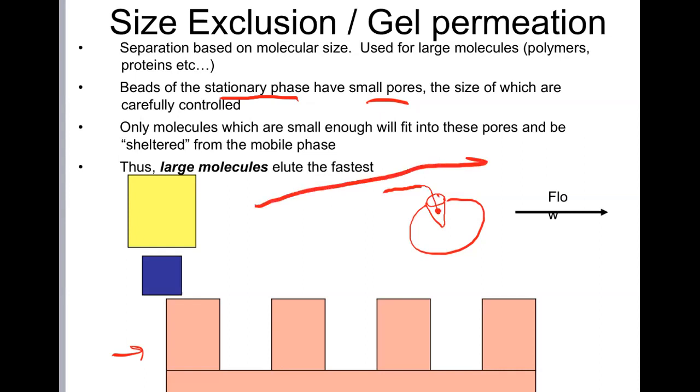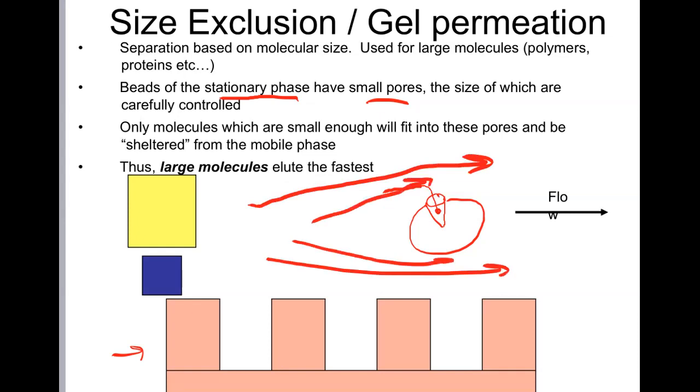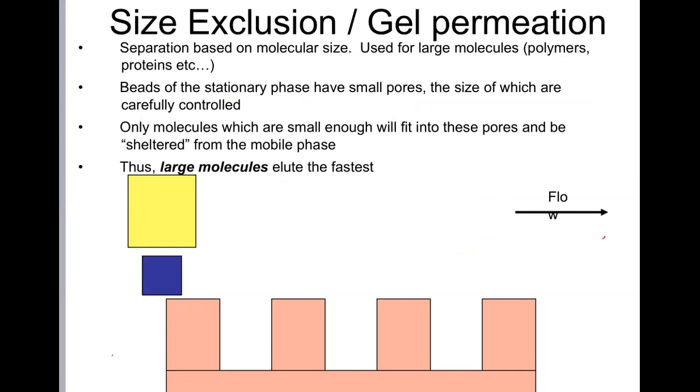Now this is my stationary phase. So what I'm doing is percolating my flow of fluid around these particles through the column. But if the molecule gets down that pore, it's kind of sequestered away. So if it fits in the pore, the molecule can be retained, sheltered from this mobile phase flow, and it's not going anywhere until it just so happens to diffuse out, and then it can get swept down the column. So these pores basically are used to sequester molecules away. Now, only molecules which are small enough will fit into the pores and be sheltered from the mobile phase. If the molecule is too big, it won't fit.